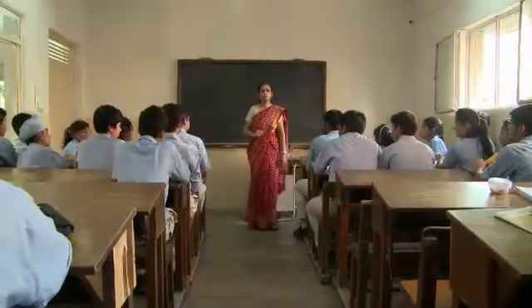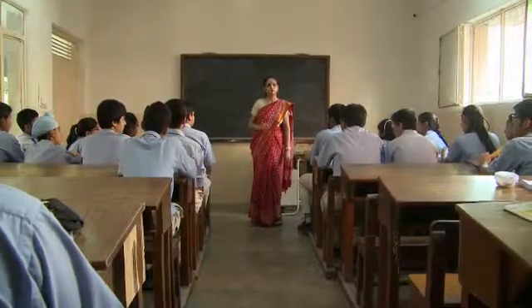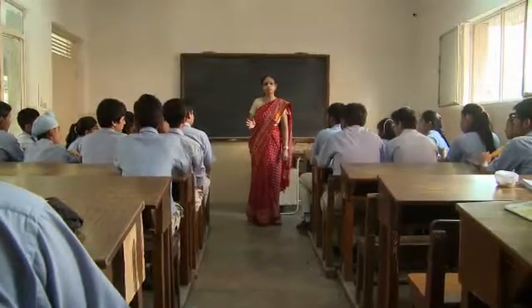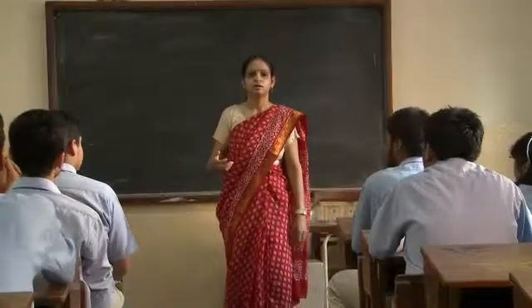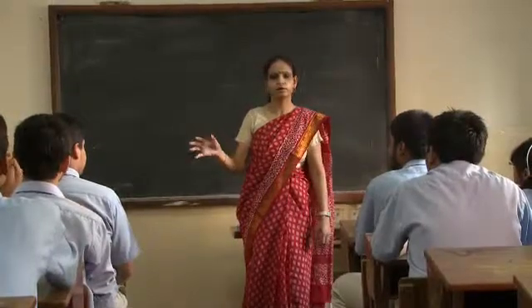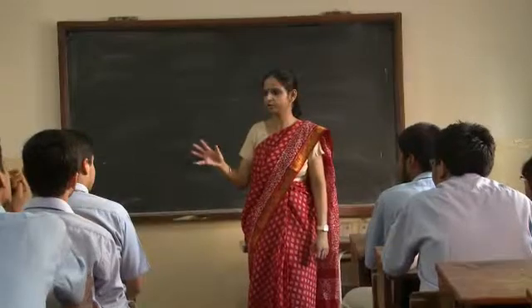Okay, good morning everyone. Today we are going to study natural indicators, the role of natural indicators, and how they are used for testing various acidic and alkaline substances. For that purpose, we are going to divide the whole class into 4 groups. We are going to work with 4 natural indicators.